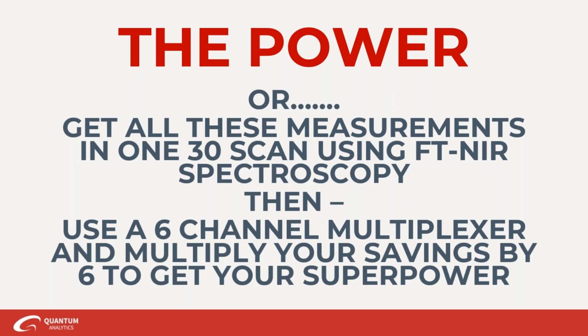So yeah, that's been measured in many different kinds of things. Depending on what you're trying to model, as I had mentioned, the different particle sizes may have an adverse effect, because it's one of those sources of variability. So if that's not what you're trying to measure, then you want to maybe reduce the effects of that. And you could do that with one of the data pre-processing methods like the SNV that I showed you earlier. But if that's what you're actually trying to model, or measure using the calibrations and the near-infrared spectra, yes, particle size is something that absolutely will affect your NIR spectra and can be modeled, and you could monitor that for sure.